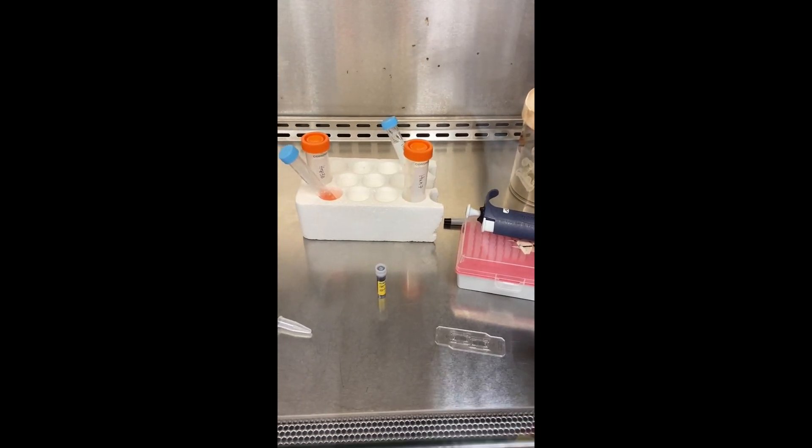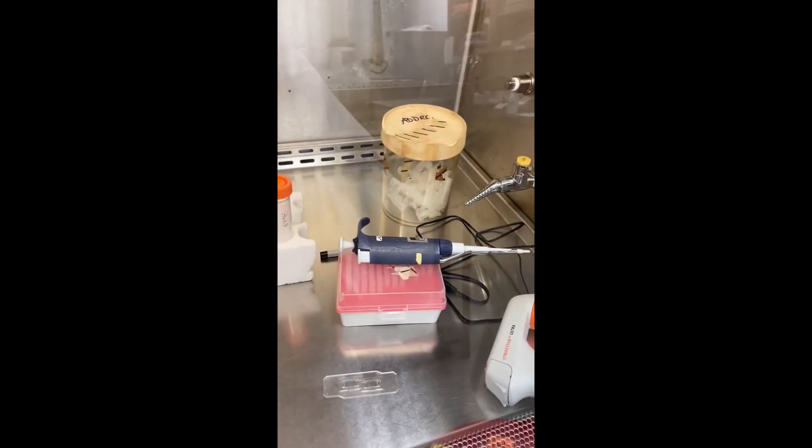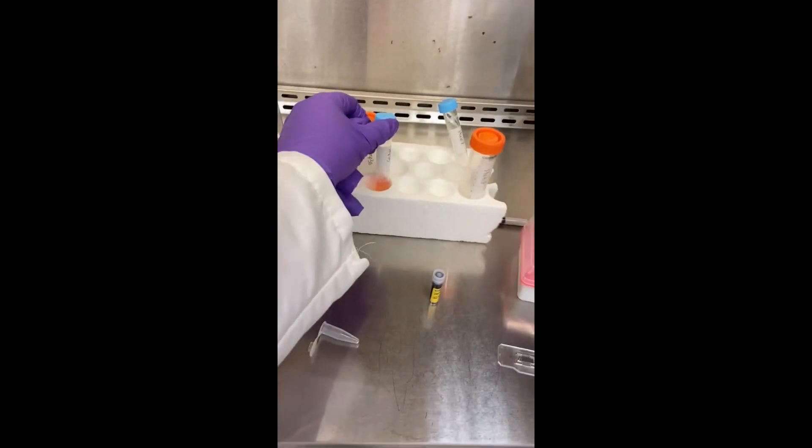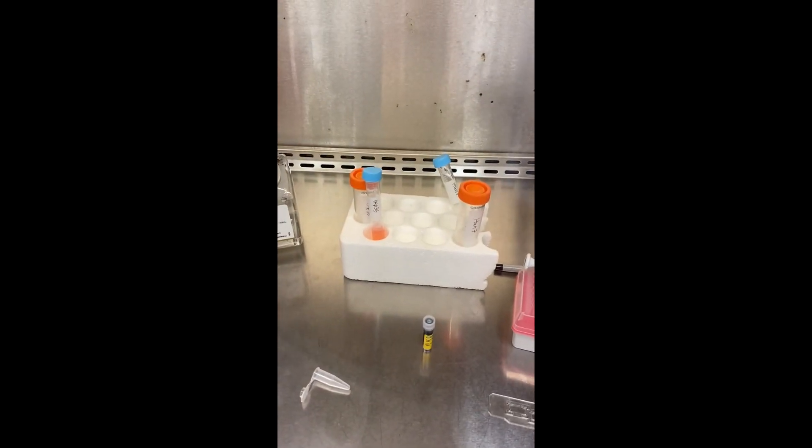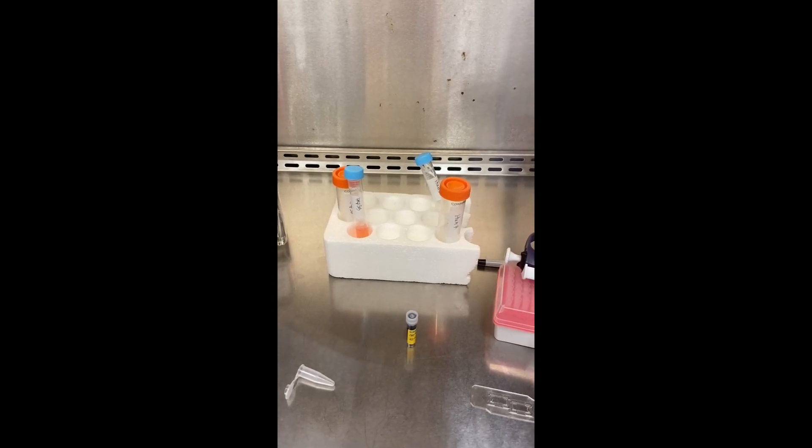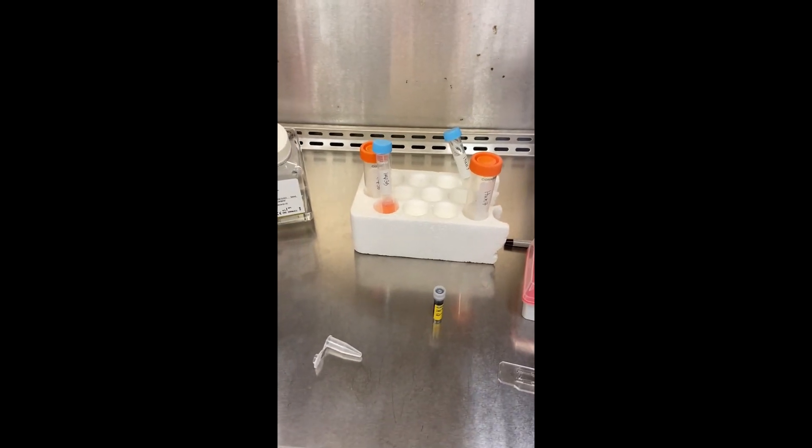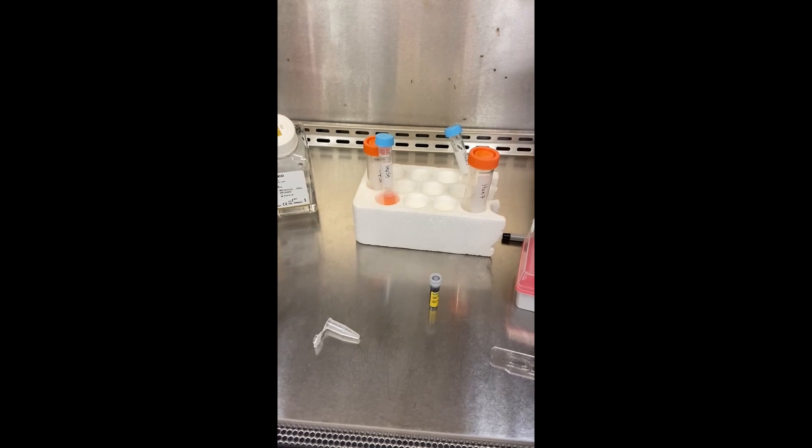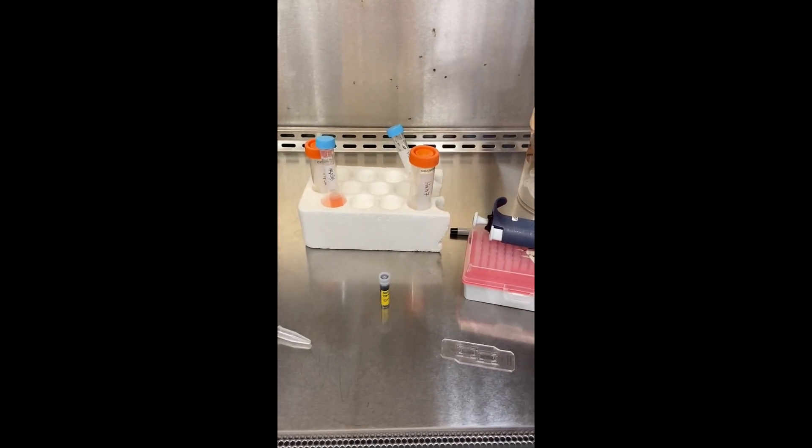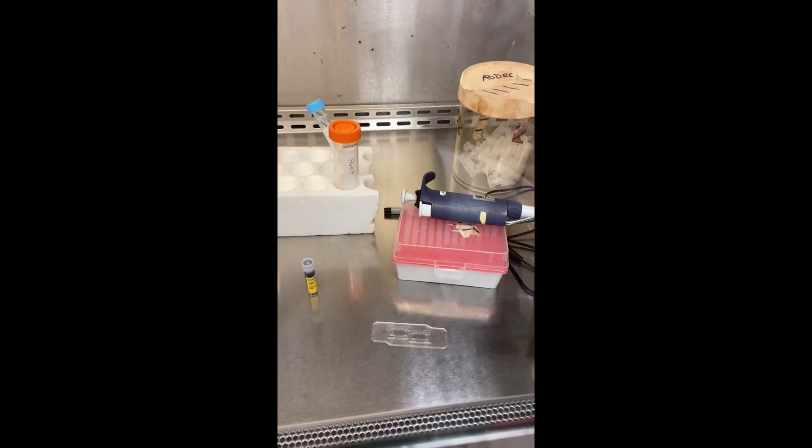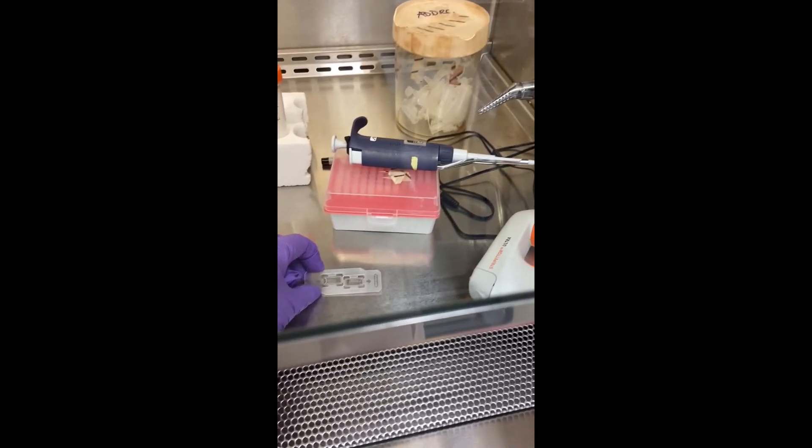So what I'm showing you right now in this tube is a mixture of my cells that I am getting ready to count. This is all in the tissue culture hood, so I have my eppendorf tube, my trypan blue, my pipette, and my slide counter.